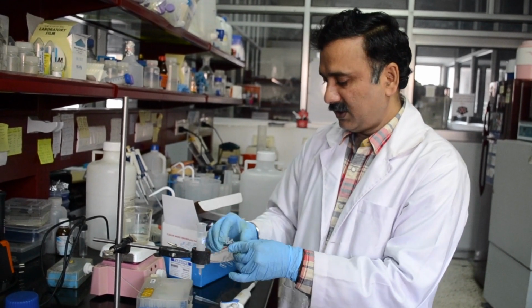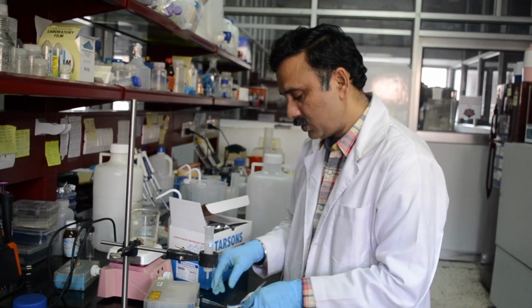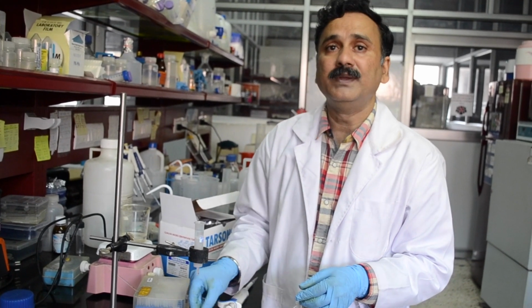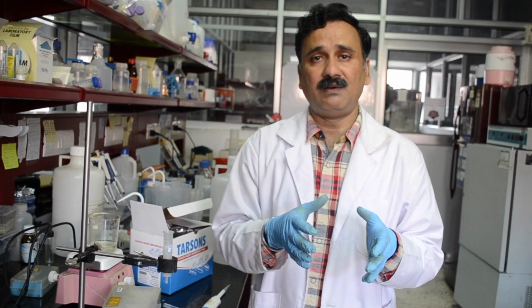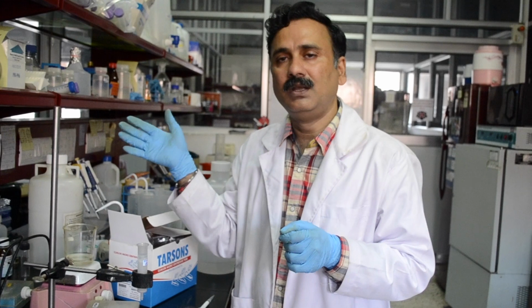If you collect these fractions and analyze them on SDS-PAGE, you will see that the initial 3 fractions have the protein of your interest, where fraction number 2 has the maximum amount of protein, and fractions 1 and 3 have a lower amount. And from fractions 4, 5 and 6 you are going to get the salt.